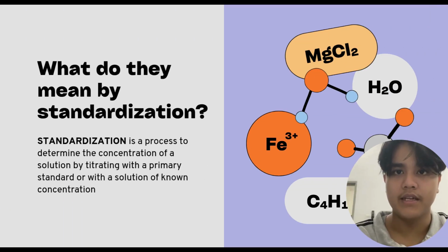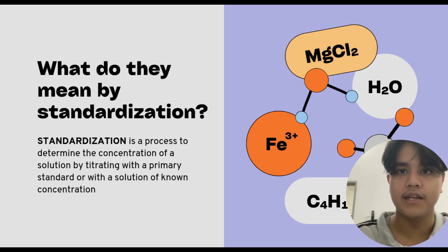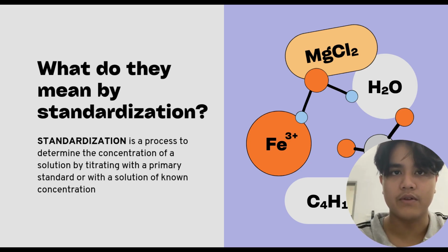What do they mean by standardization? Standardization is a process to determine the concentration of a solution by titrating with the primary standard or with a solution of known concentration.